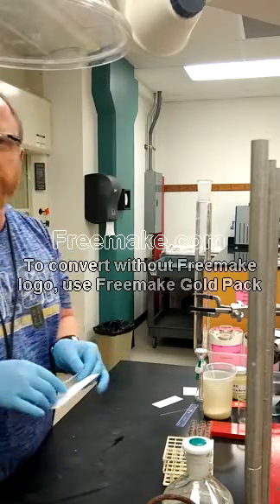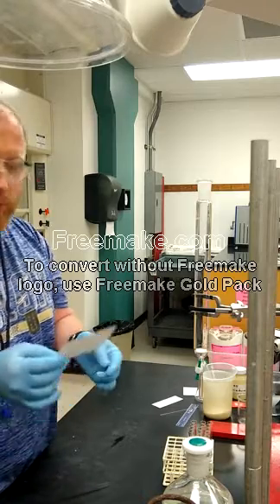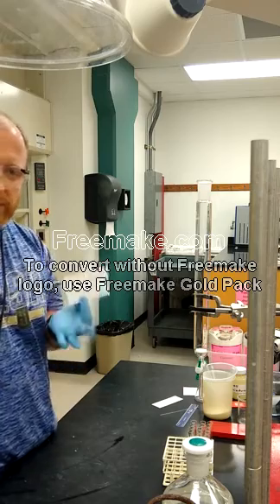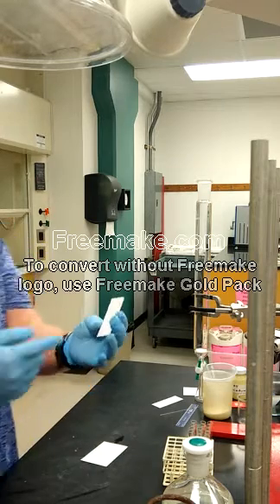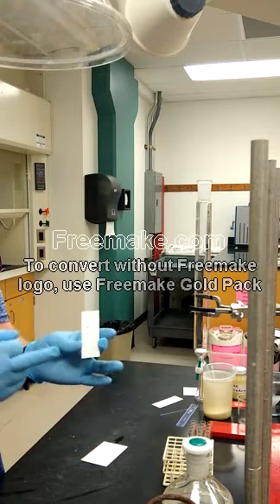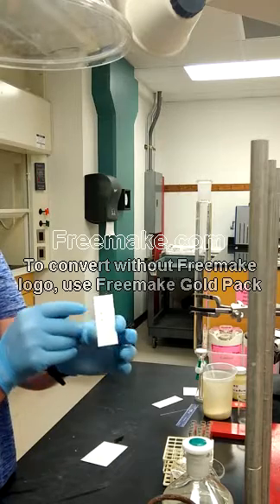Since we've had to turn everything into online coursework, we're going to make a good run at experiment eight. This experiment is called chromatography and you're just building upon what you did in the TLC lab. With silica gel TLC, your less polar compound would travel further up the plate and your more polar compound would hang lower, and you would adjust the mixture you're using for your eluent to change how those two spots separate.